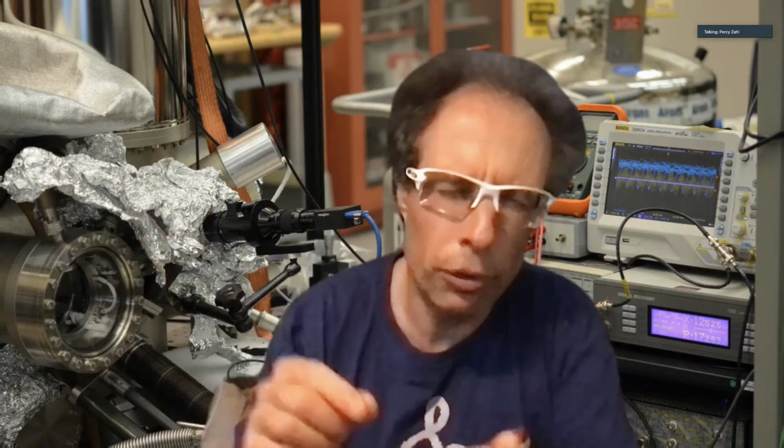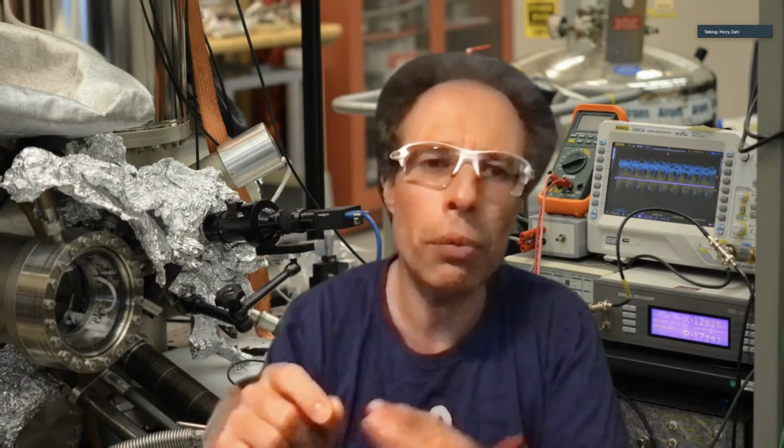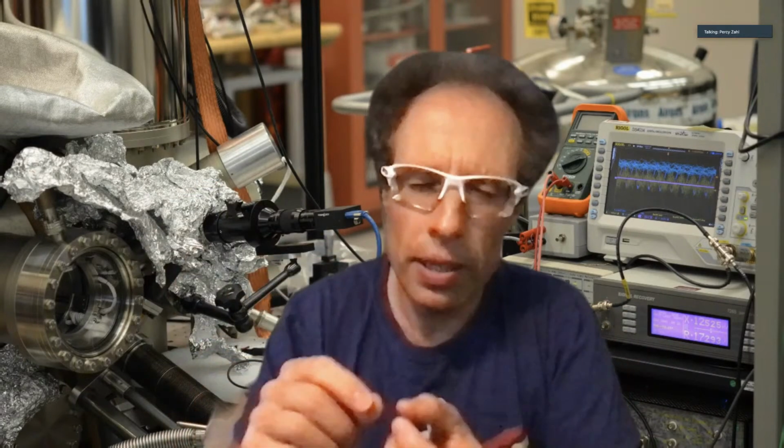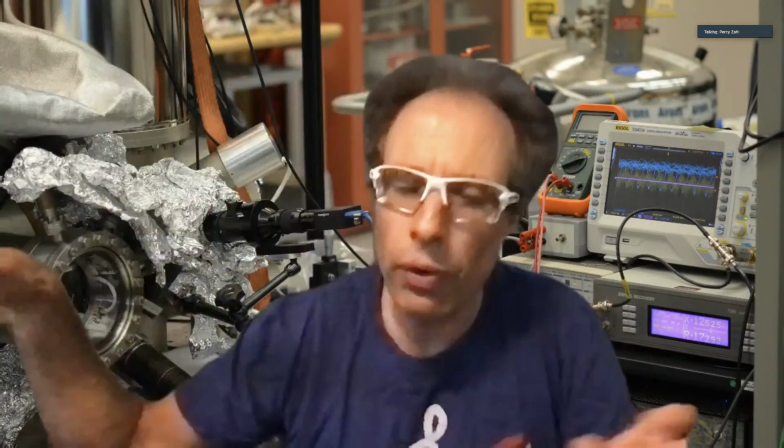You put a tiny crumb of something, micrograms, whatever, just a dust on some surface, like a piece of silicon on the outside in air, and I put it in my vacuum. I can heat the surface up, and then the dust pretty much flies off, so it evaporates, and I point it towards my sample in the microscope. If I do it right amount, I get just a very few molecules spread out on my white tablecloth, and I can eventually image them.